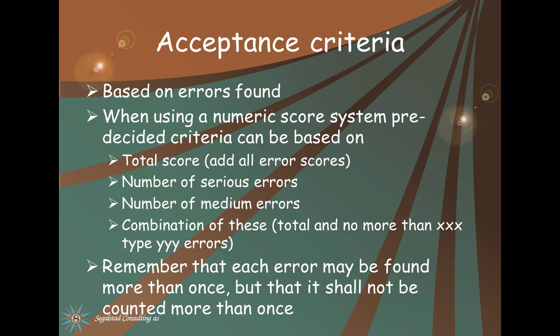The validation plan also needs to cover acceptance criteria. They are predefined in the validation plan. It's easy to write that we do not accept any errors and no errors is the desired outcome, but it is kind of difficult to live with as we usually do find some errors. It's also impossible to foresee which errors you will find and to discuss or rate them upfront. Instead, you can define a score system for serious errors, medium errors, and errors we can live with, and have that defined in the validation plan.